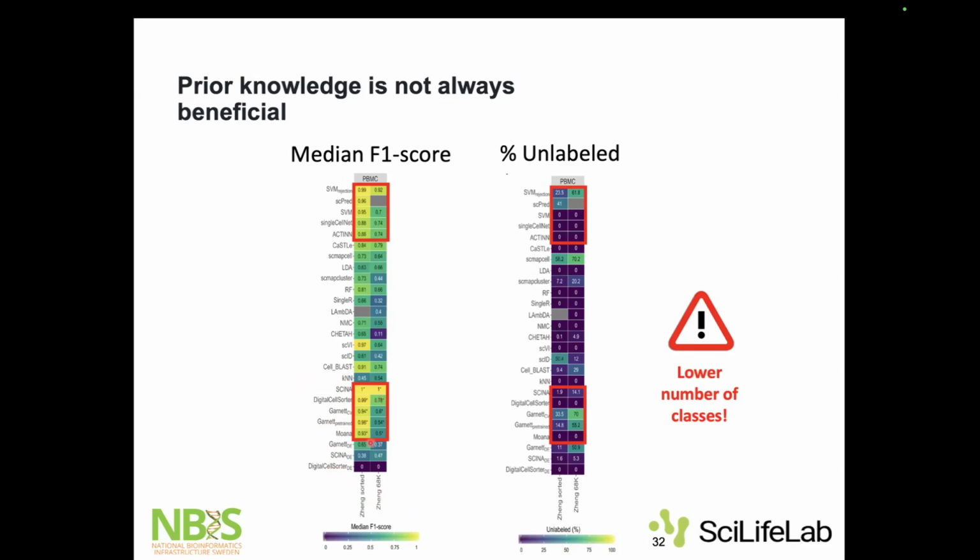But here, in these 2 data sets, the first one has sorted immune cells, and this is the whole population of PBMC. They had the marker genes with the data that they used, but as you see, with the asterisks here, they included only 3-4 cell type markers for 3-4 cell types, not all the cell types. We see that they perform well, but just imagine that they are only performing on those cell types that they had the marker genes for.